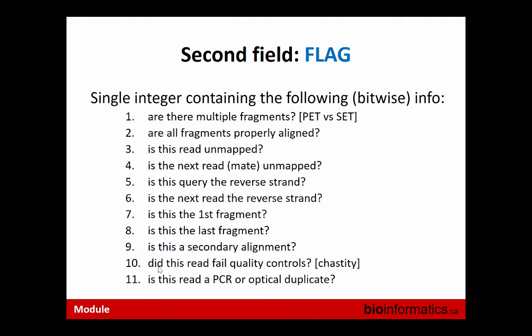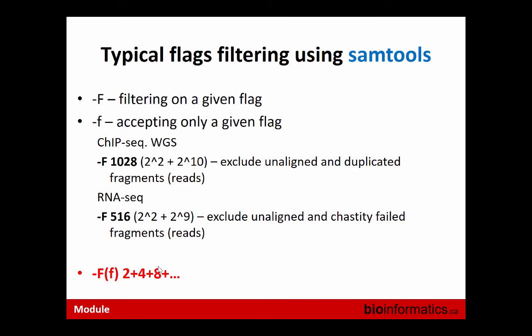However, some tools, which we are going to discuss in a moment, will allow us to filter reads based on the value of this flag. So for example, if you would like only reads aligned on the negative strand, you can filter with this flag and only pick up those reads. You can do many, many different things. And it's very, very helpful.